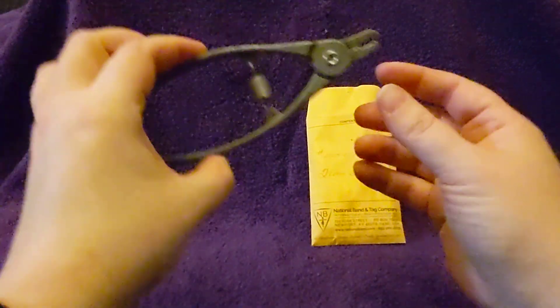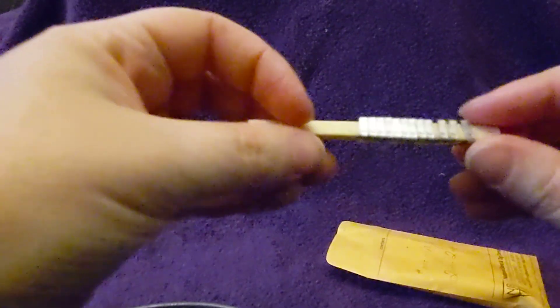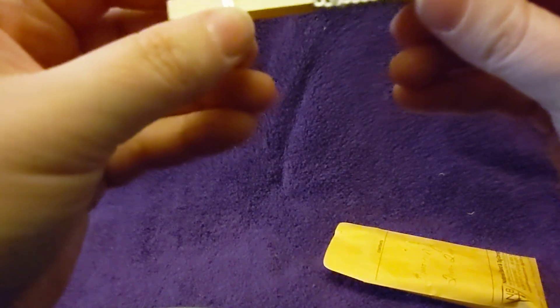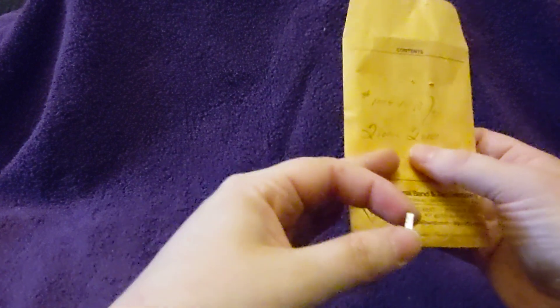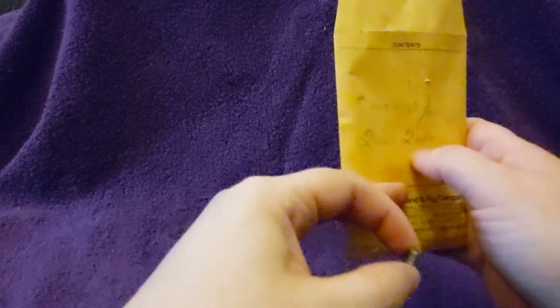This is a tagging tool and these are identification ear tags. They come in a little package like this. You can get them numbered sequentially only, but you can pick which number it starts at.